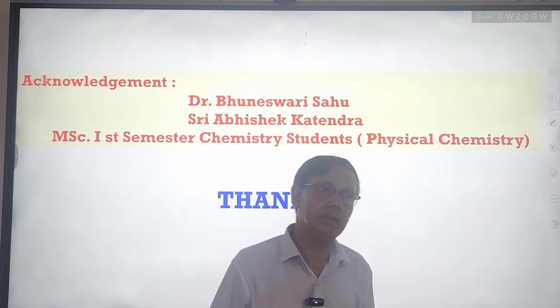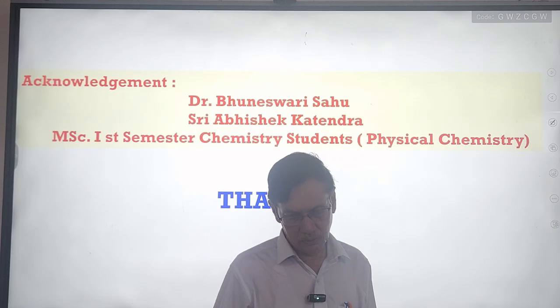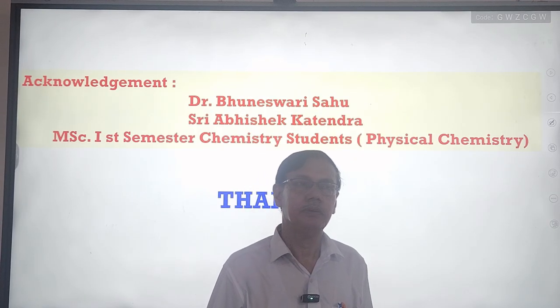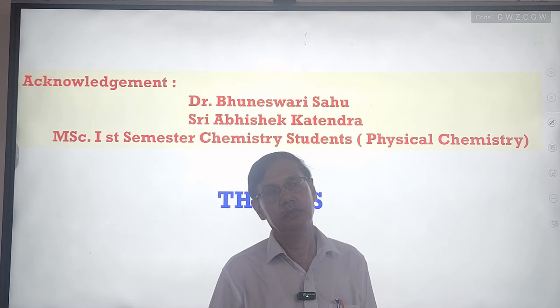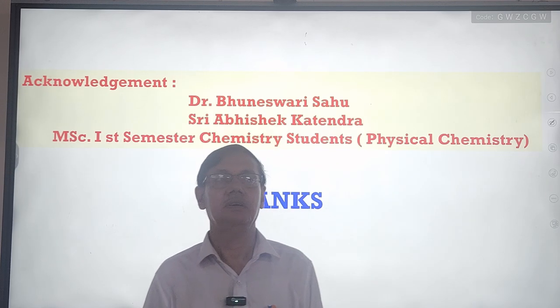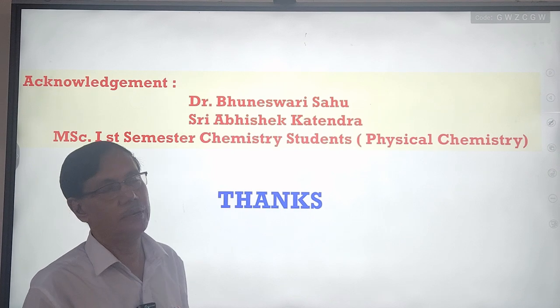In my next experimental session, I will discuss another important experiment, the pK of benzoic acid or para-nitrobenzoic acid by pH metric titration.